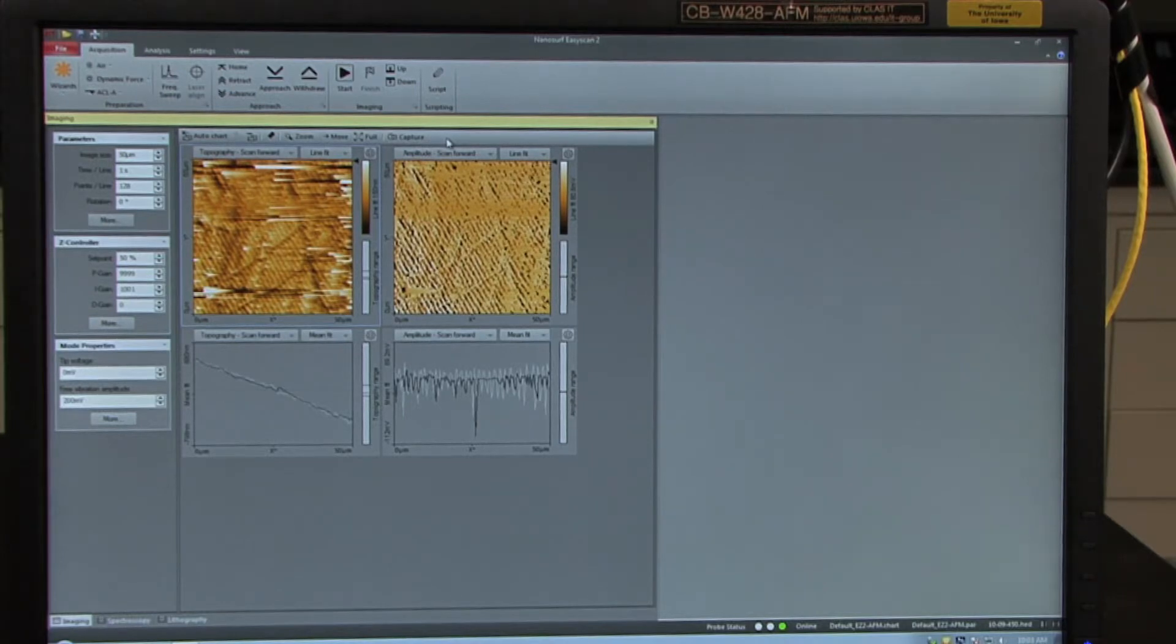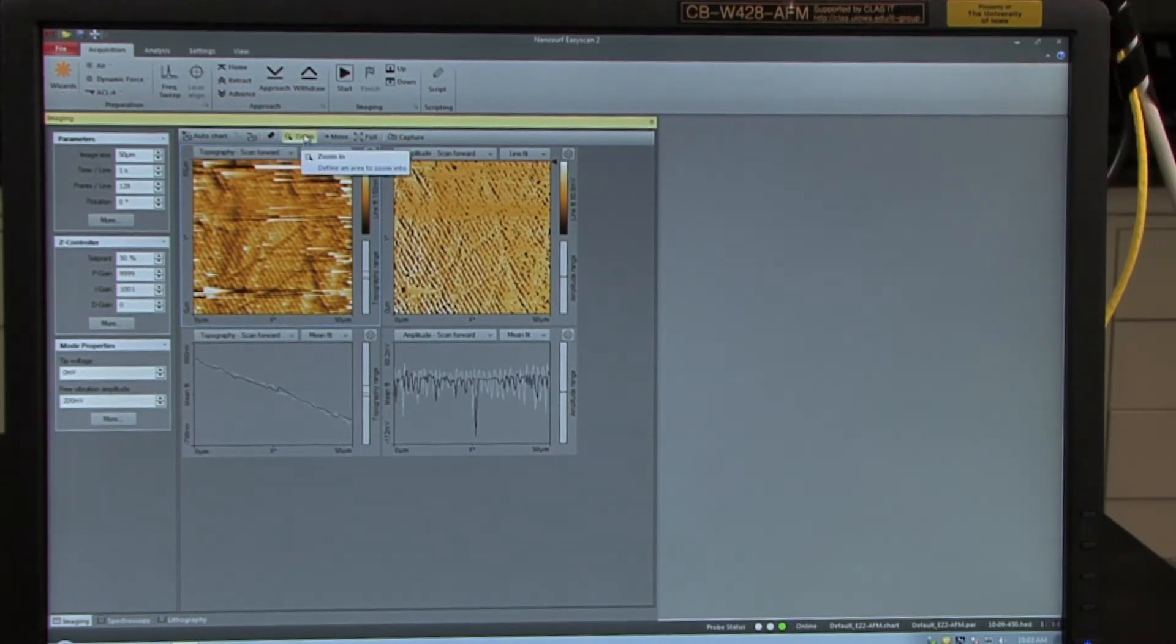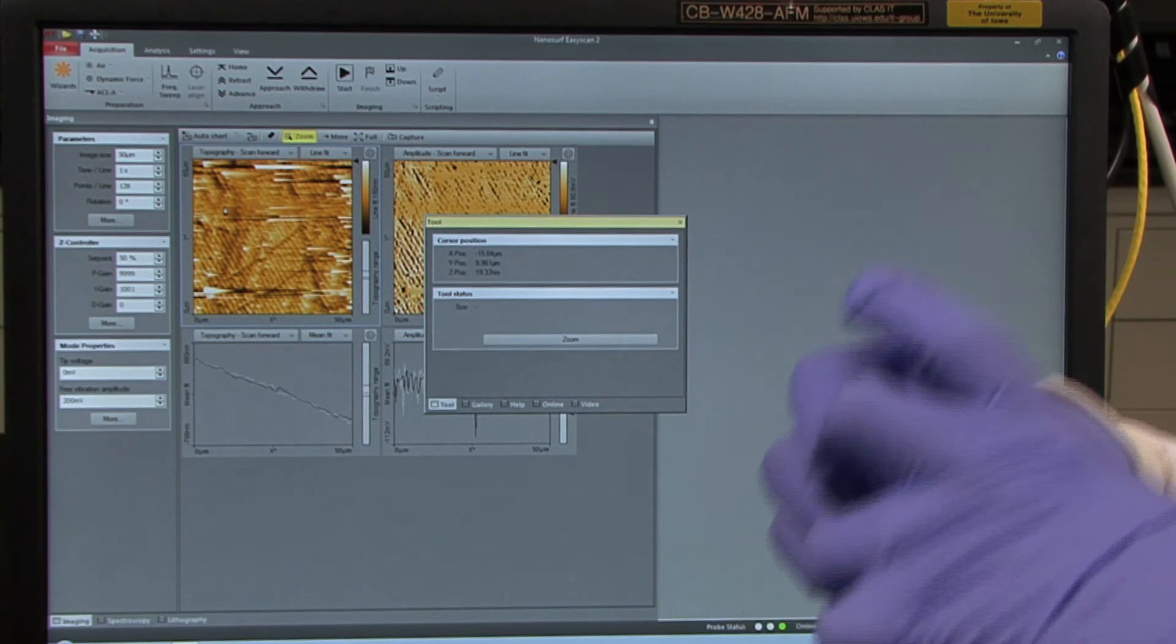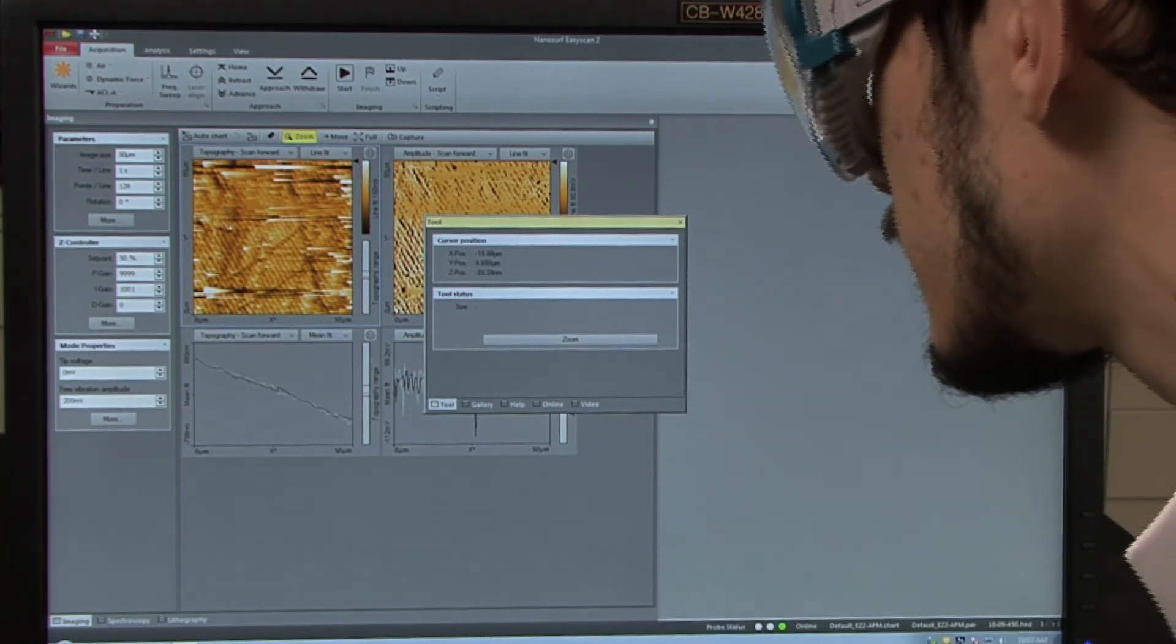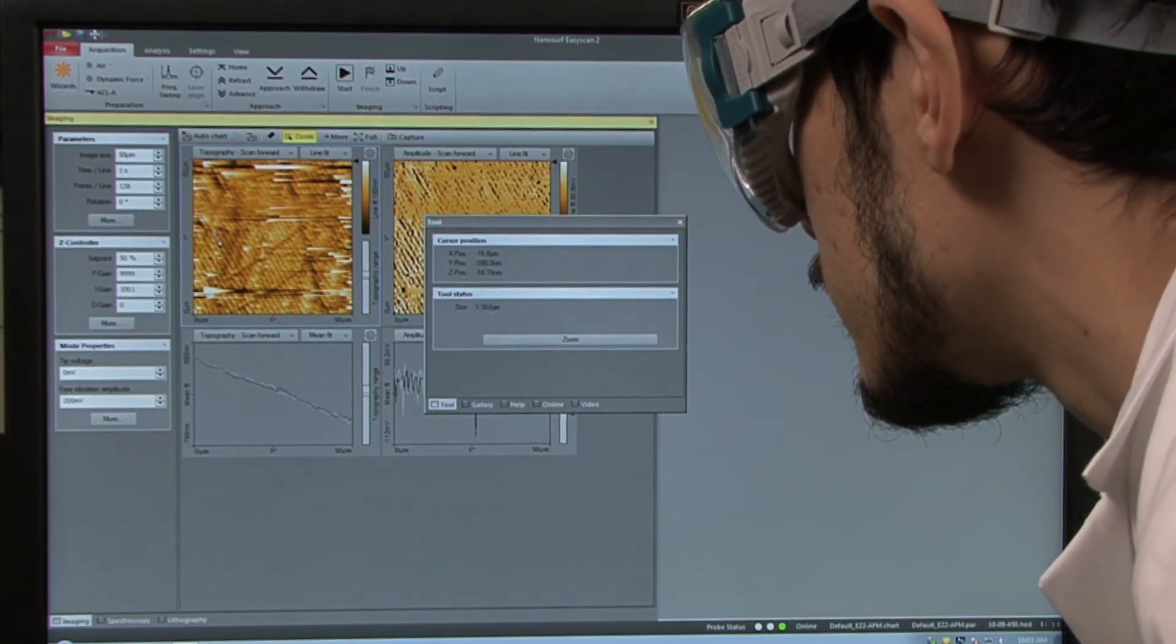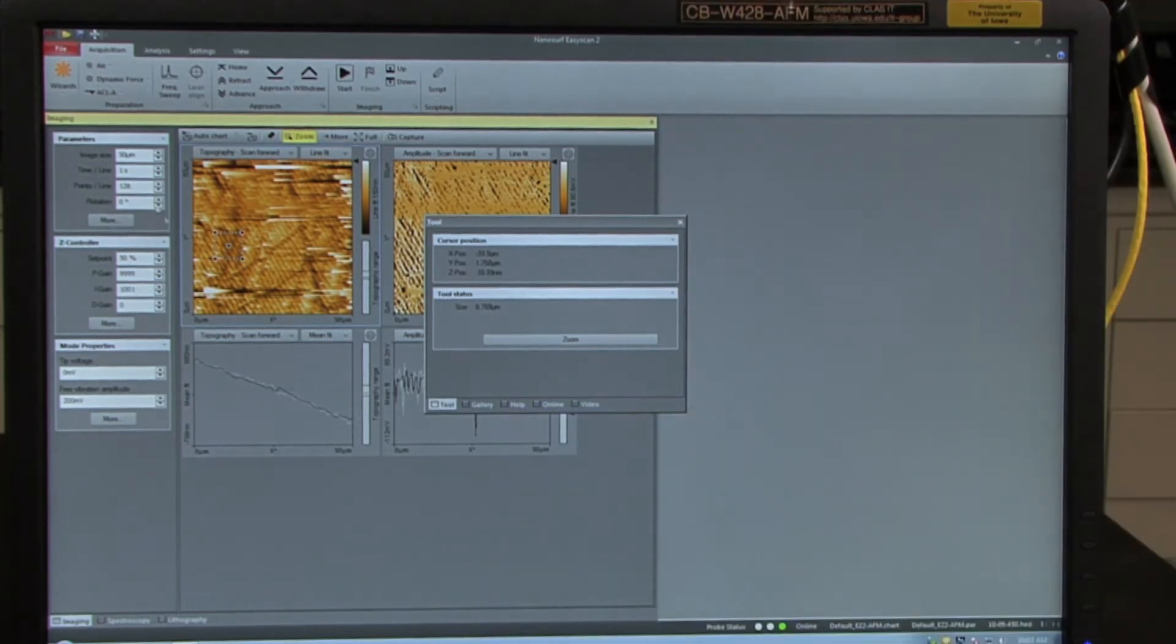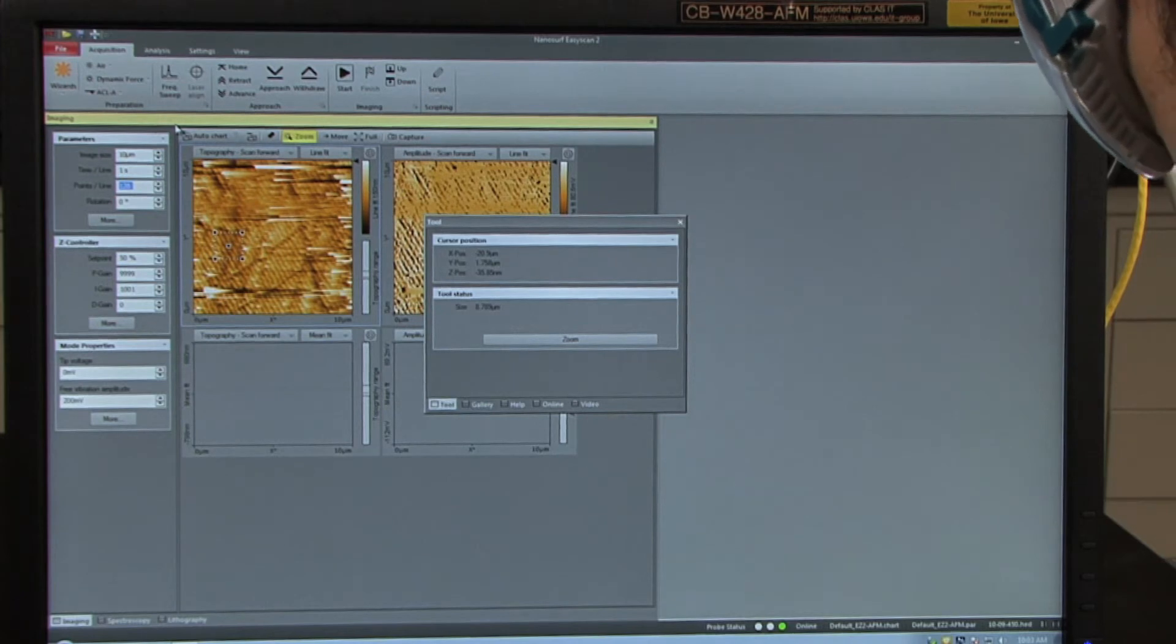Once you have an acceptable image, you'll want to zoom in on the area of interest. In order to do this, you want to click on the zoom feature on the auto chart, and carefully draw a box in which the feature you're interested in is directly centered in that box. Once you release, go over to parameters, change the image size to 10 micrometers, and the number of points per line to 256 to double the resolution.